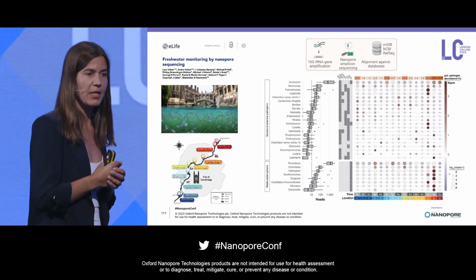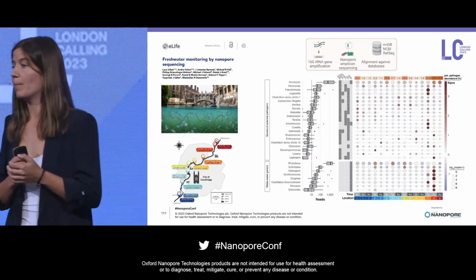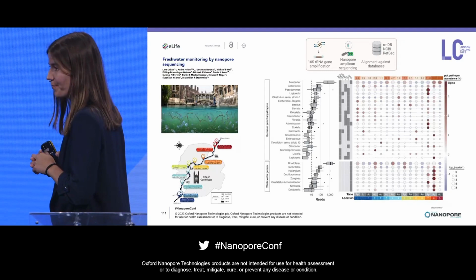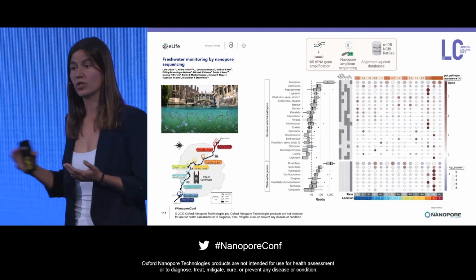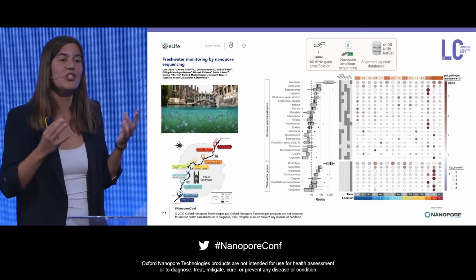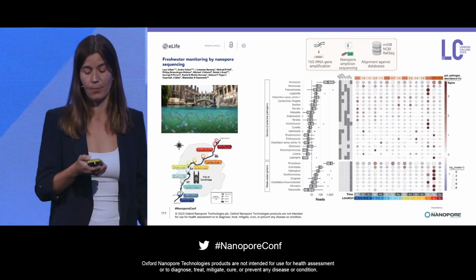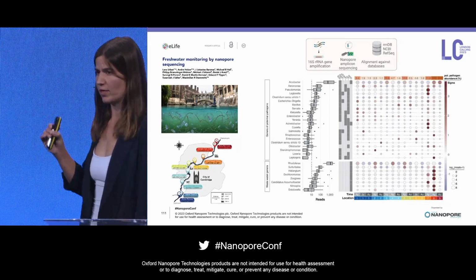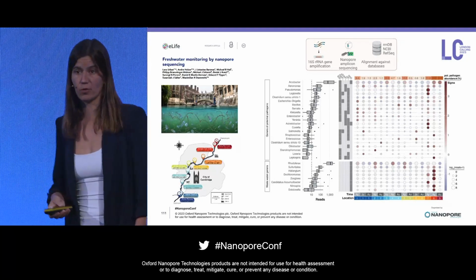What worried us a little bit is that we also found an enrichment of some potentially very virulent pathogens downstream of this wastewater sewage pipe outlet, which made us hypothesize that the general microbial community was changed by anthropogenic impact like this, changing the ecosystem in such a manner that potential pathogens can flourish, a prime example of One Health. Unfortunately, with this sort of approach, we were not able, with high confidence, to go down to the bacterial species level or to do any functional annotation.